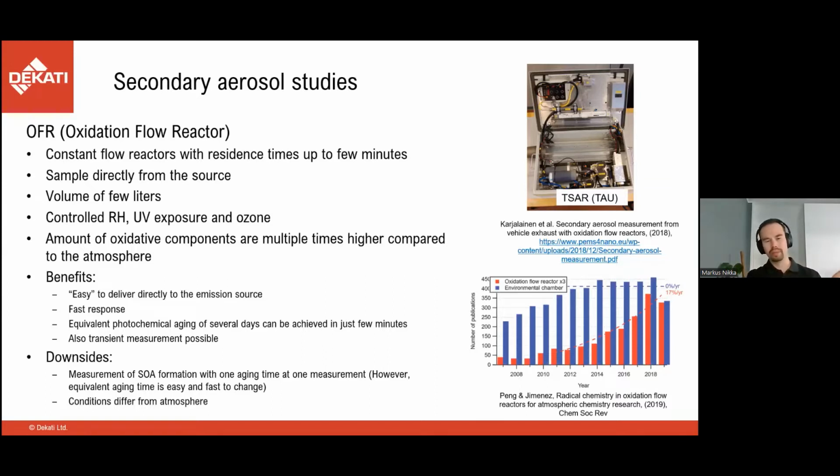So the sample takes 1-2 minutes to pass through the reactor from the emission source to the instrumentation, and inside the reactor, the equivalent aging time can be several days, which enables also transient measurement because the response time is quite fast.